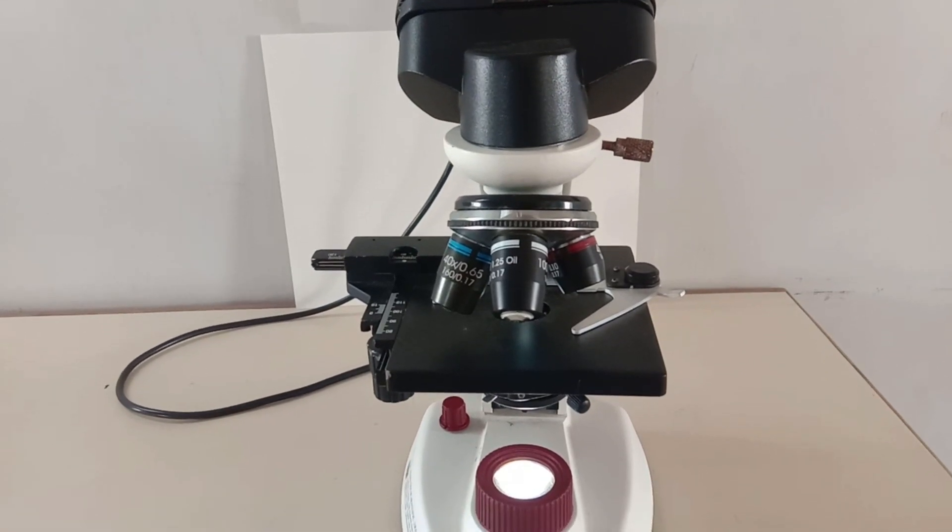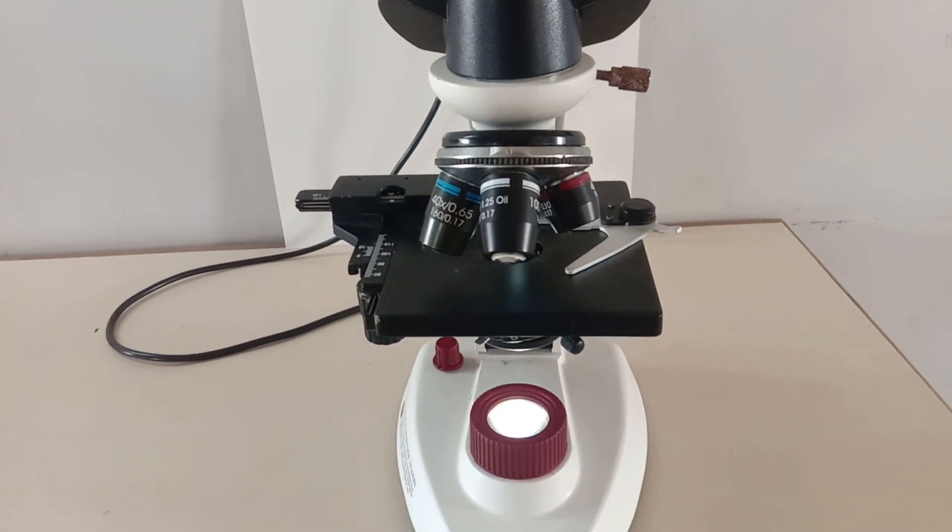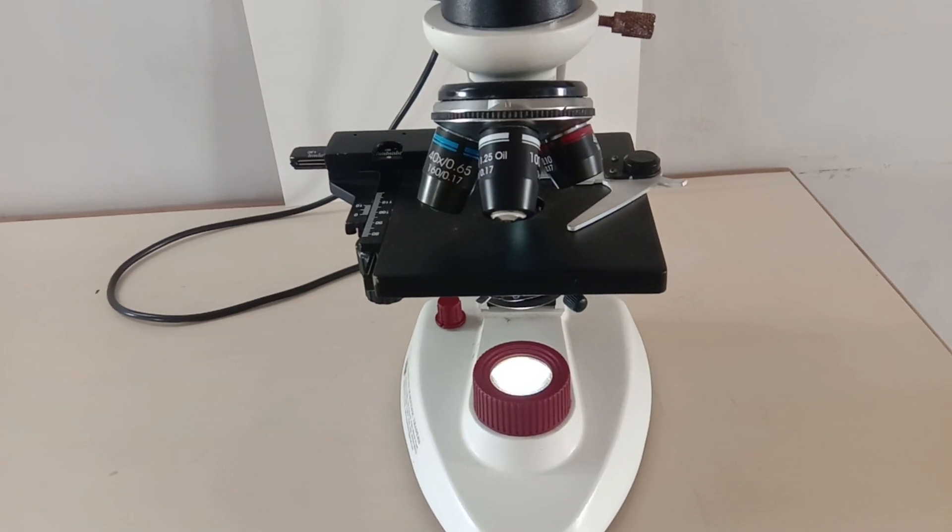The one near the eye is called the eyepiece and the one near the object is said to be the objective.